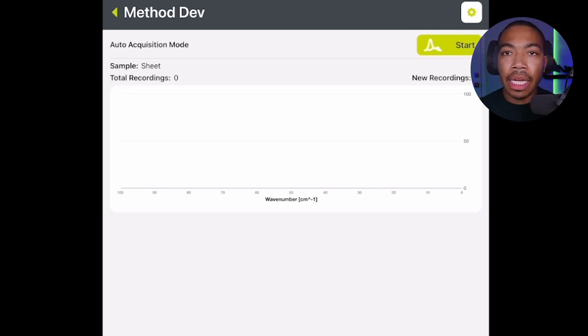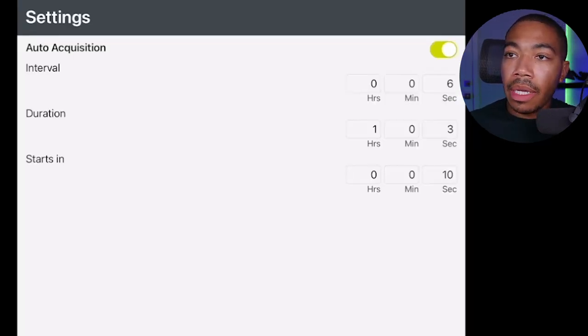And so I'm going to begin showing you how we can develop methods for the various product forms that we're going to be analyzing. And I intend to bring you on that journey, but I want to motivate you with what we are going to do on this little experiment here. So what I'm going to do is take a sample every 6 seconds, and it will start after 10 seconds. And we're going to just move the near-infrared spectrometer through each of these squares, and we will look at the spectrum that's produced, looking for which spectrum looks different than the 8 others.